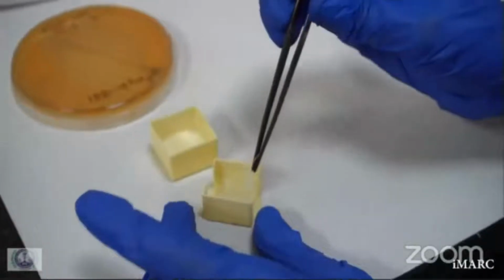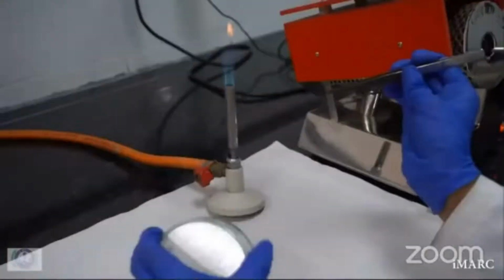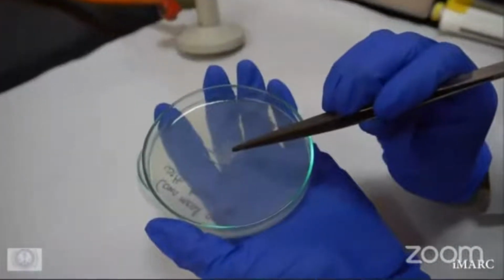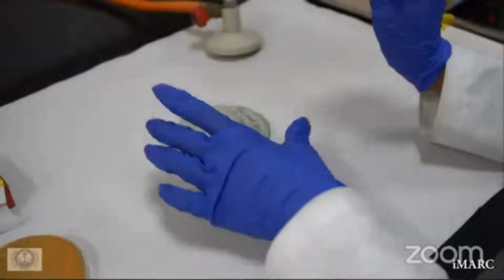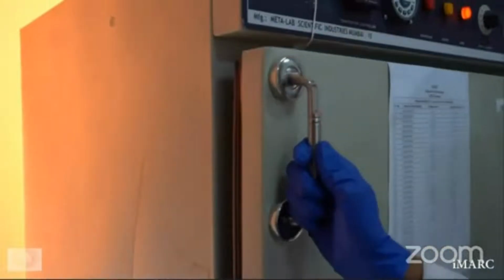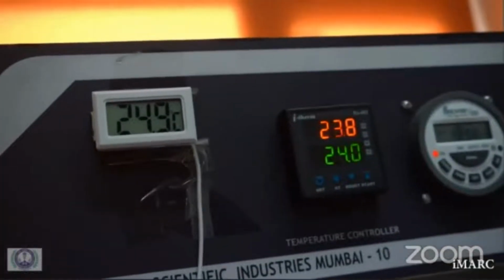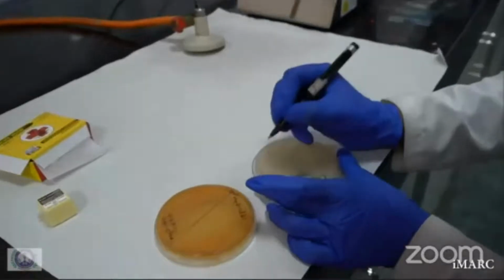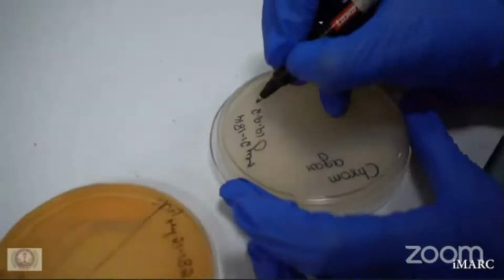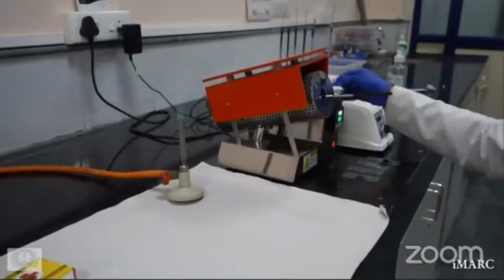Thus, it provides a partially anaerobic environment at the margins. The plates are incubated at 25 degrees Celsius for 3 to 5 days. Remove the lid of the Petri plate and observe under the light microscope for morphological features like hyphae, pseudohyphae, chlamydospores, etc.